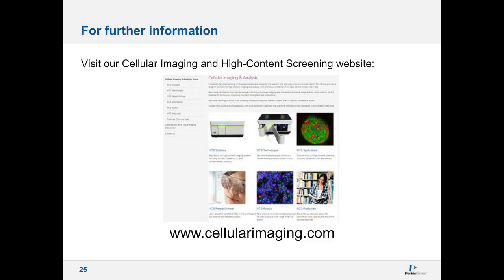Dr. Tesdorpf, I believe you can answer this one as well. Can we do wide field, then switch to confocal? Yes, absolutely. So this is perfectly possible in this system. We can offer both modes in the system.